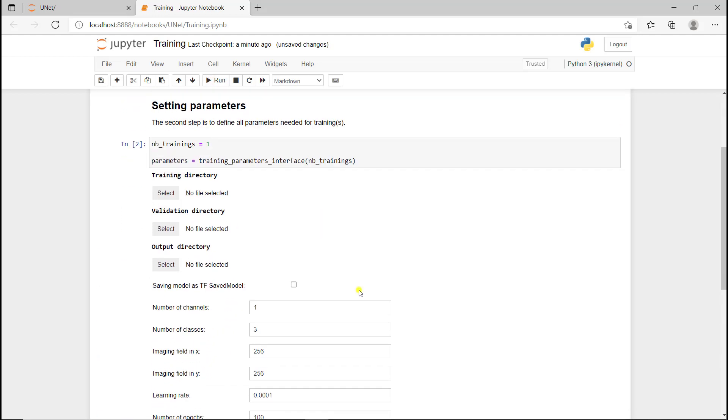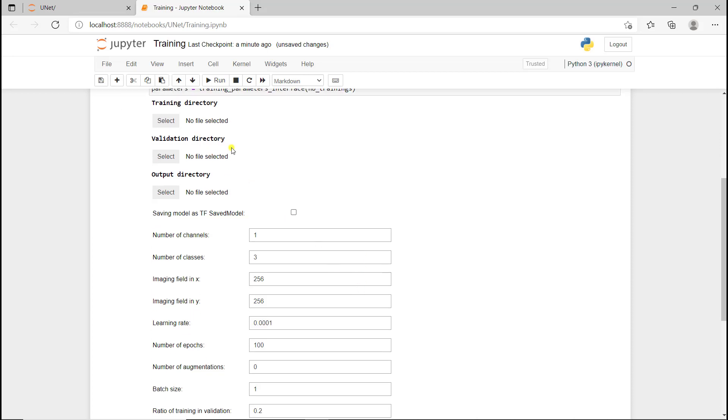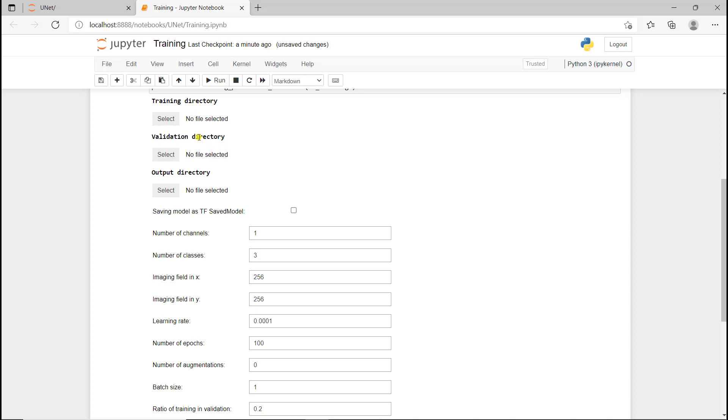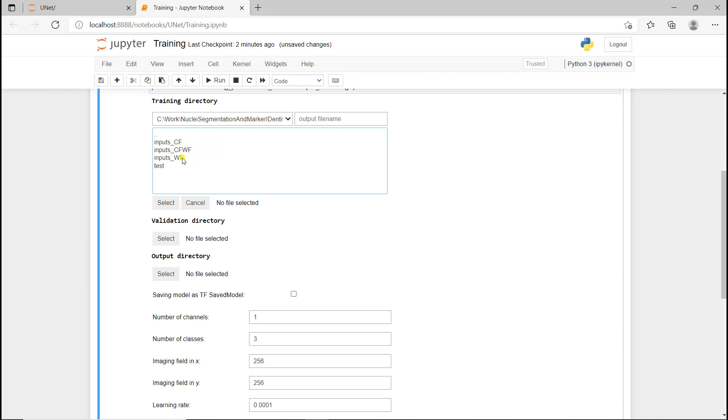Now I'm going to define all the parameters. The first parameter is which data we want to use. If I click on select, I'm directly in datasets. That's where all the data is in this U-Net folder. I'm going to go into nuclear segmentation E2Fs, and here I can choose between confocal, widefield, or all. We know that U-Net is not great when we pull everything together, even though it's not that bad. Here I'm just going to test using the confocal images for training the U-Net models.